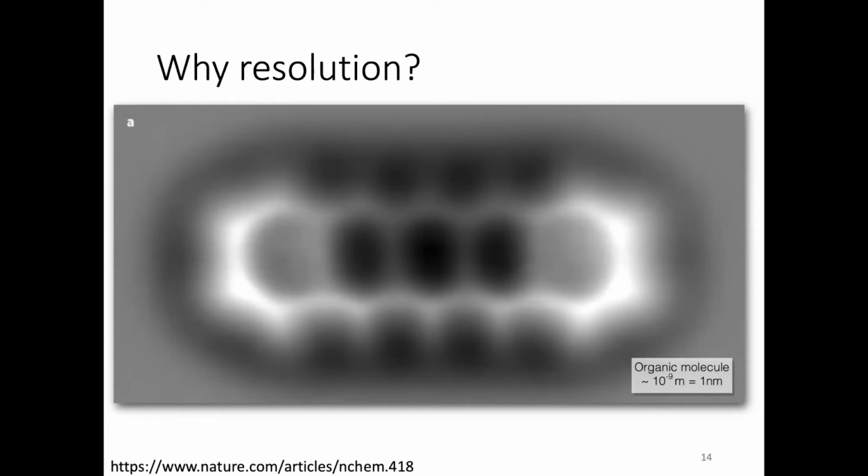We're only going to talk about light microscopy, but it's just to show that many different tools have been developed to look at structures at different length scales. And each one has its pros and cons, the same for the techniques I will show you today. But basically in the last 10, 20 years, there has been a big revolution in the resolution that we can resolve.